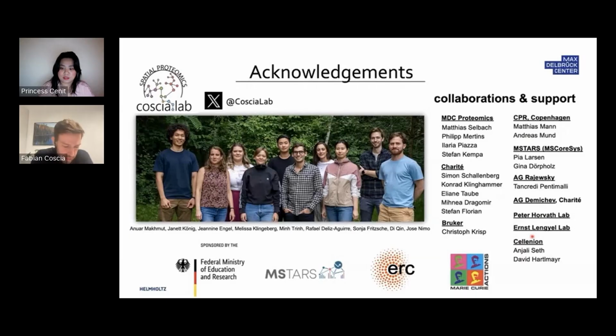One important aspect is in particular if the idea is to use these omics data to guide clinical decision making in the future, right? This is, I guess, one of the very big hopes that these technologies can provide one day. So if we have very powerful genomics and transcriptomics methods, I think it's also very important to validate and confirm that your drug target that you're suggesting for therapy is also really present in the tissue. Here, I think proteomics methods can be helpful to further prioritize which therapeutic strategy might be an option.